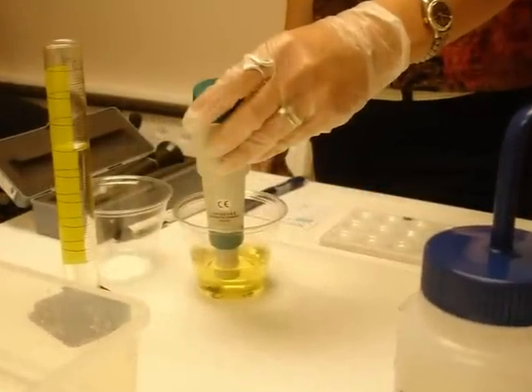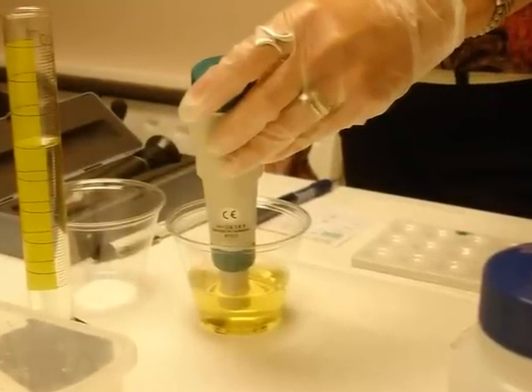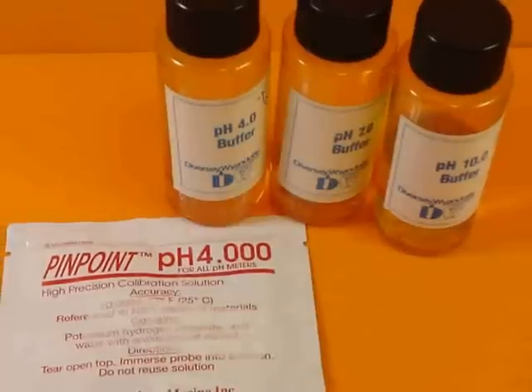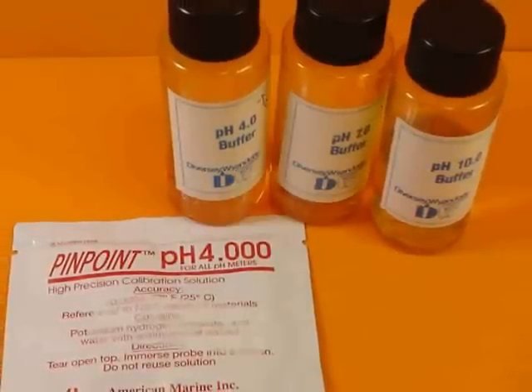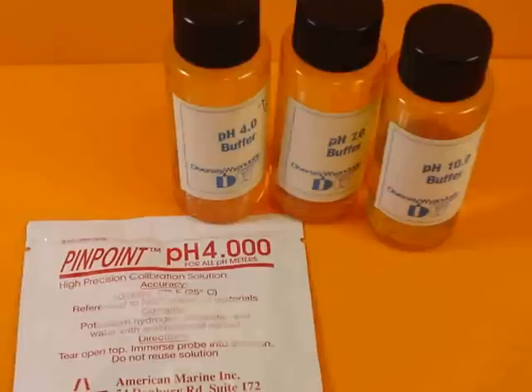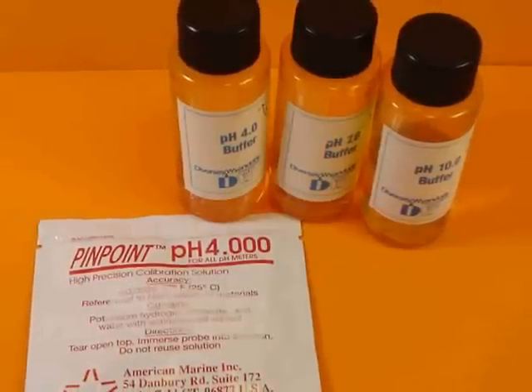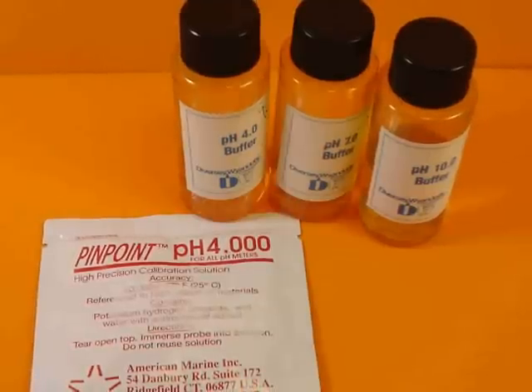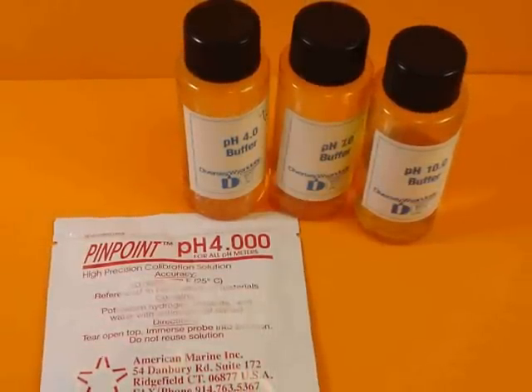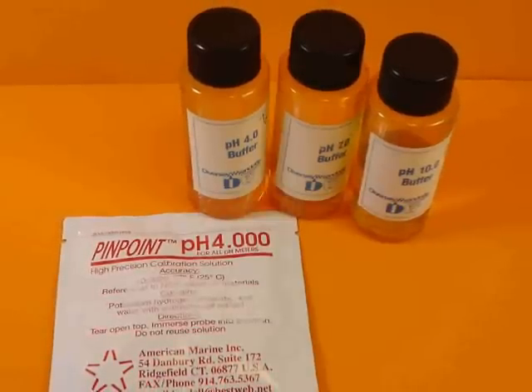As stated before, some testers like to use pH meters. That's your choice as long as you're absolutely sure of your accuracy. Many beginning testers ask how can I be sure of my result? The best way is to get some pH reagent test solutions, put some in your depressions, and test it to see what you get. That way you can get a pretty good feel and develop some confidence in what you're coming up with.